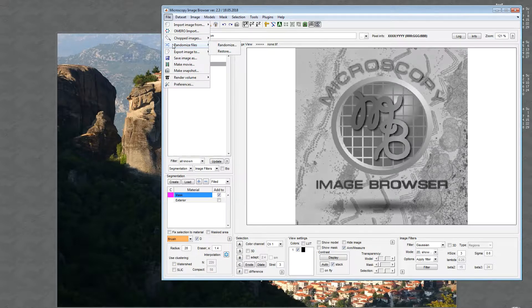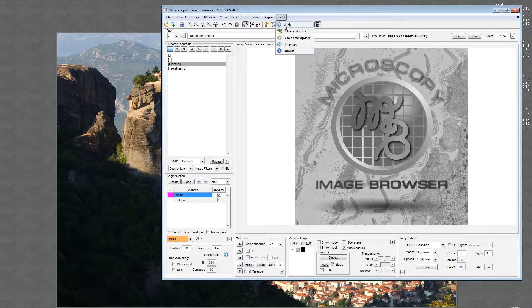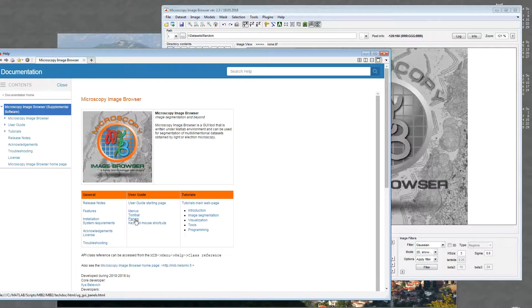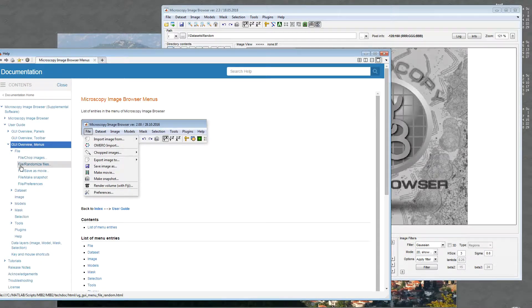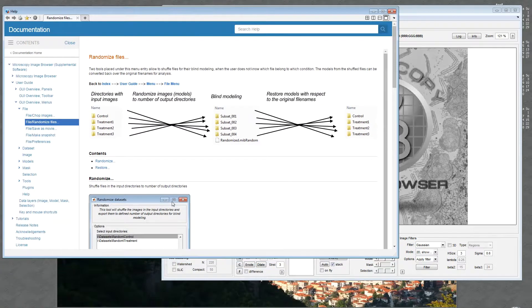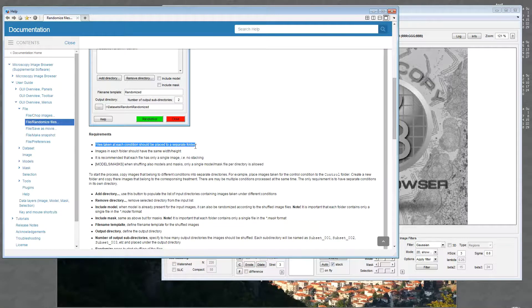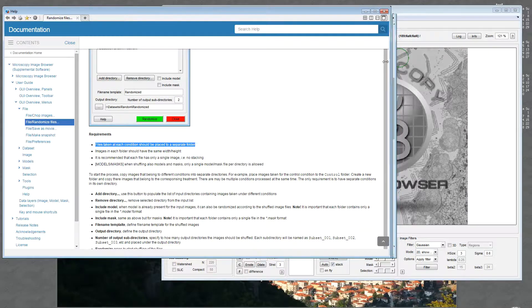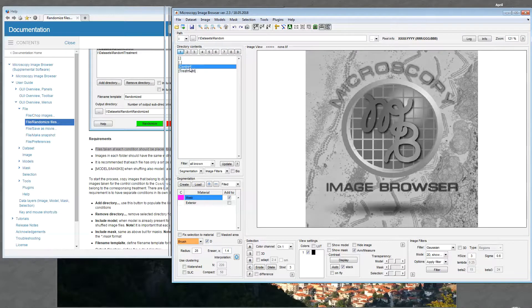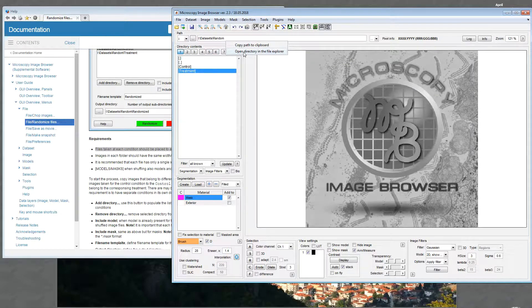It is also possible to restore the results — basically to take the models and masks that were generated and put them back over the original images. There are a few limitations which can be seen from the help system under Menus > File > Randomize Files. The files which you want to analyze should be placed under different folders for each condition.